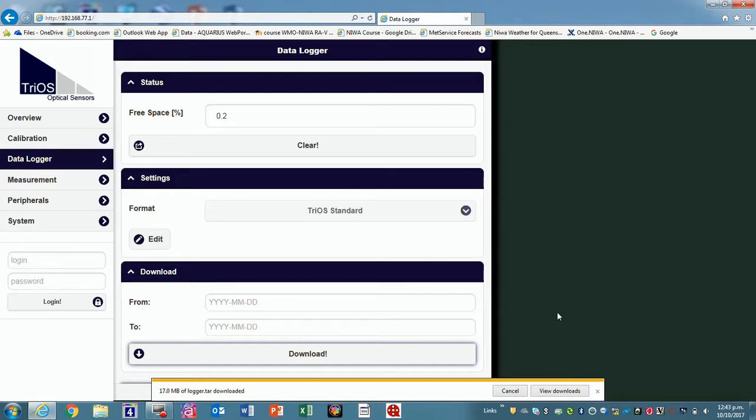So what's the main use? Basically it's a backup to your data. You get all the parameters which the sensor stores, nitrate, nitrite, also the raw absorption data at the specific wavelength. So you can potentially go back if you've got a problem in your record through the Neon system, and you say, oh, we had a data outage there. You can see it was also on the sensor.